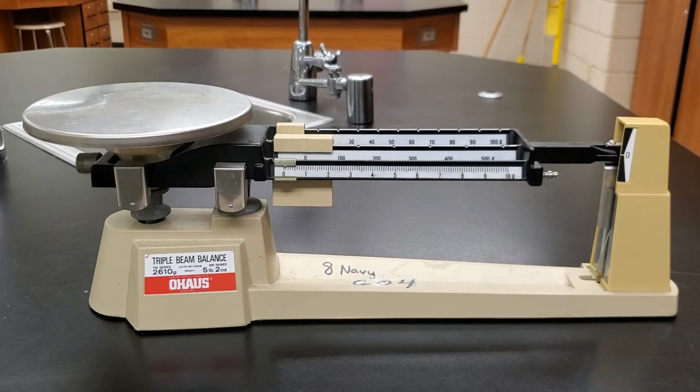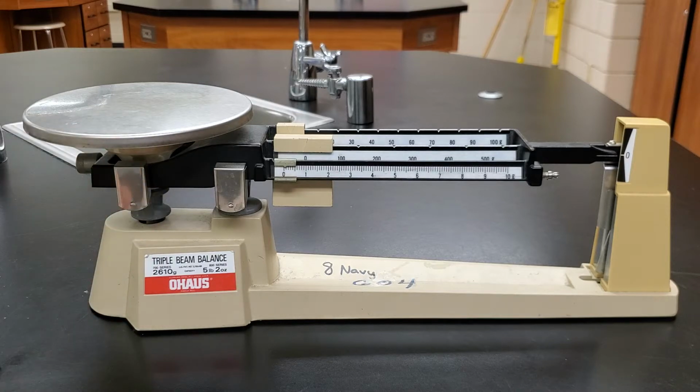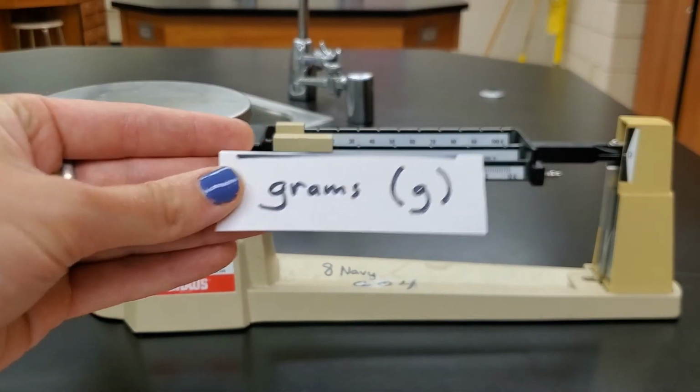Okay guys, the next unit of measurement that we need to talk about is mass. To measure mass in the scientific classroom, we usually use one of these tools, which is a triple beam balance. You may have learned about triple beam balances last year in science, so this might be a little bit of review for you, or it might be some new stuff. Triple beam balances measure in grams. That is the unit that they use.